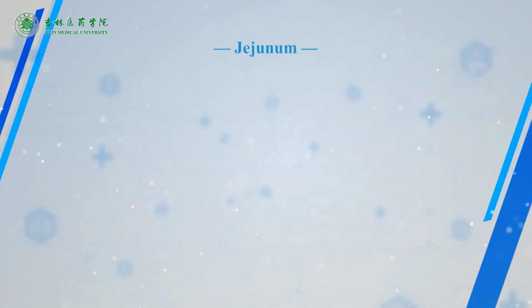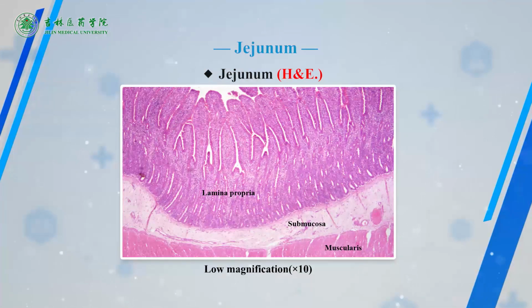The fifth slide, jejunum, obtained from the section of jejunum, H.E. staining. On the slide, there is a prominent protrusion on one side, which is the most developed plicae circulares of the small intestine.